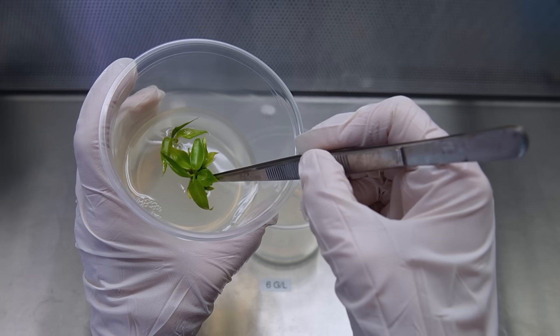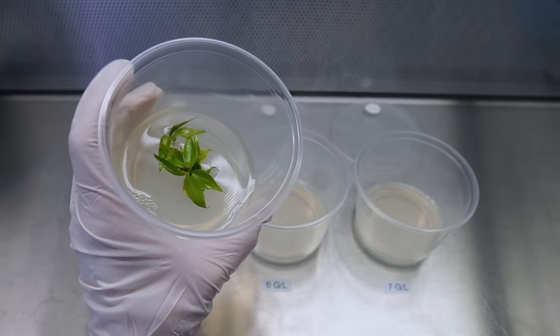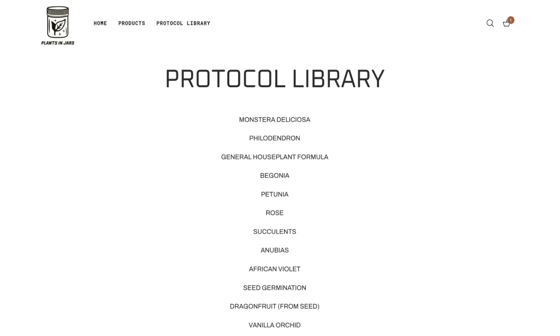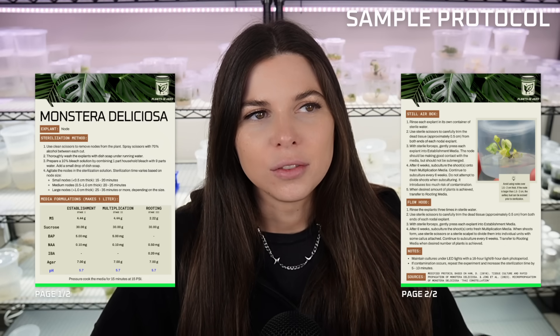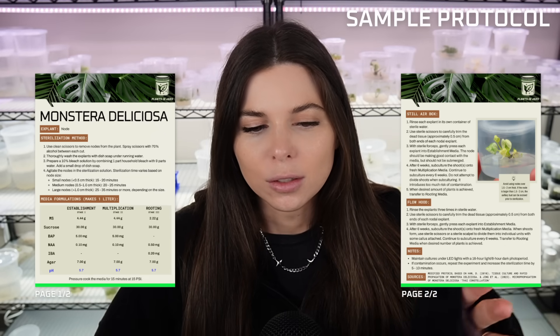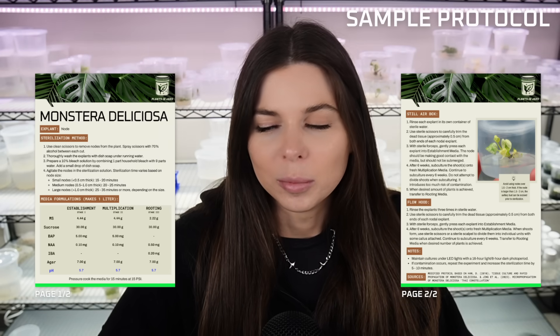Now that we have our plants, we're ready to prepare some multiplication media so we can start cloning them. The ingredients you use in tissue culture media depend on what type of plant you're trying to clone. Since most of the plants we're working with today are Monsteras, I'll demonstrate how to make Monstera Multiplication Media. Every order from plantsandjars.shop includes access to all of the plant-specific protocols I use — basically step-by-step instructions for cloning plants. Every plant is a little different, so each protocol is also a little different.